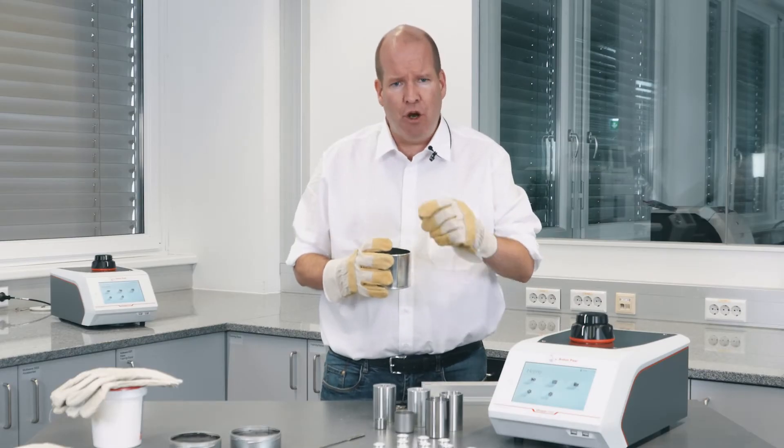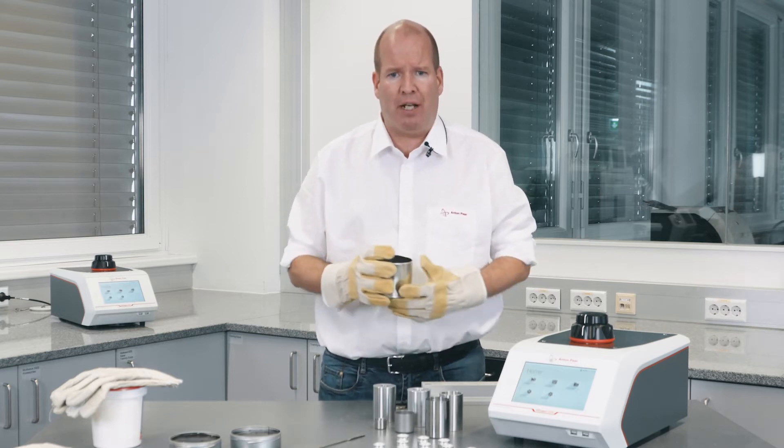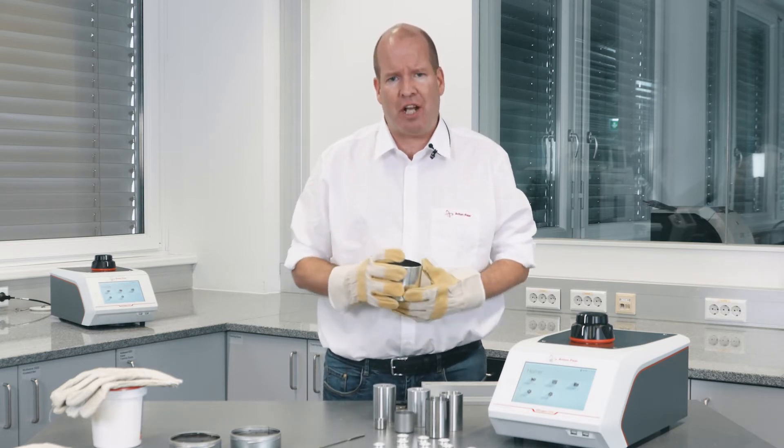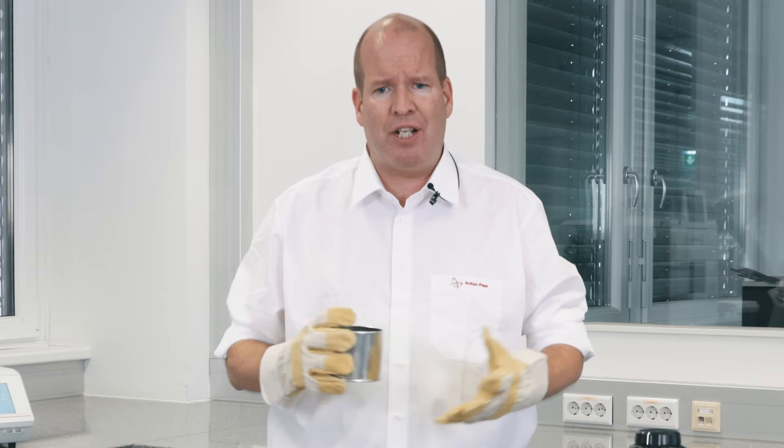The measurements are important not just for manufacturing control, but to assess how much binder is needed to cover the surface area of a particular location. And they're a standard specification procedure to ensure consistent final material quality.